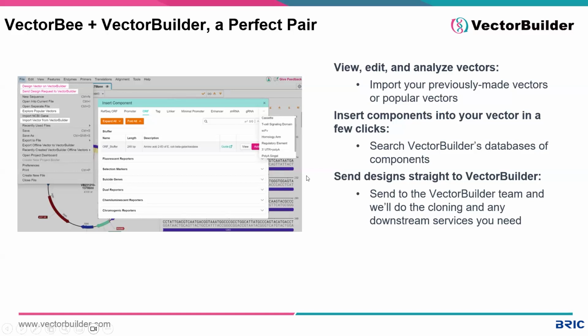You can also utilize the extensive databases that VectorBuilder has created of a wide range of components, and arguably most importantly, you can utilize VectorBuilder's not only expertise, but also ideal cloning and efficiency in order to actually create this vector and provide you with downstream services like virus packaging, as well as stable cell line generation and library construction.